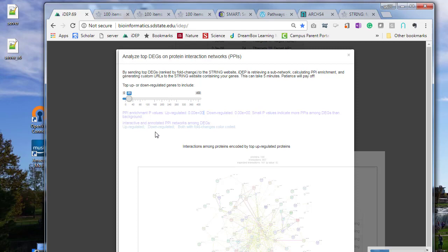So if you want to do some PCR verification, or if you bet on some other downstream analysis, selecting your top genes by fold change is much better, in my opinion, than the p-value, because it measures the size of the effect.